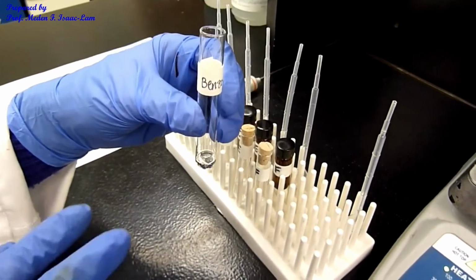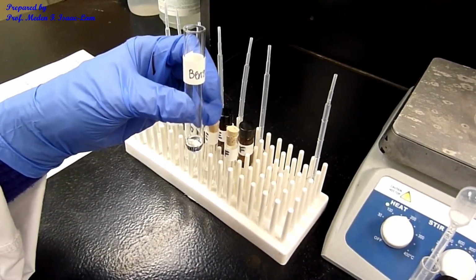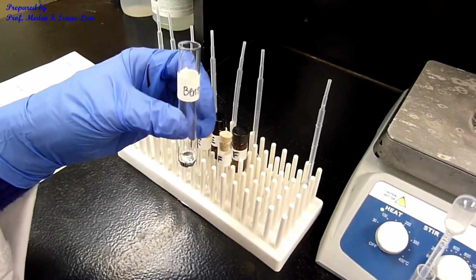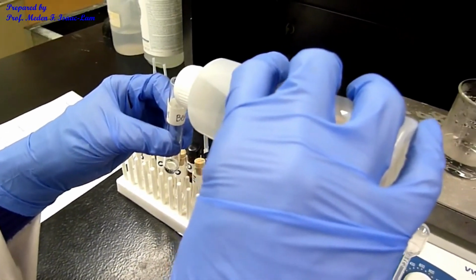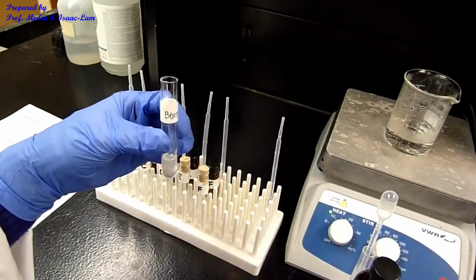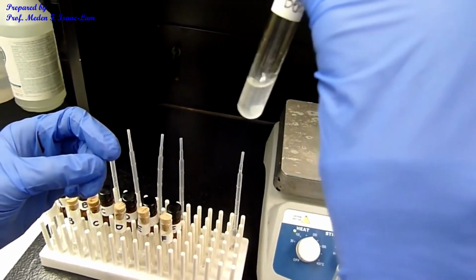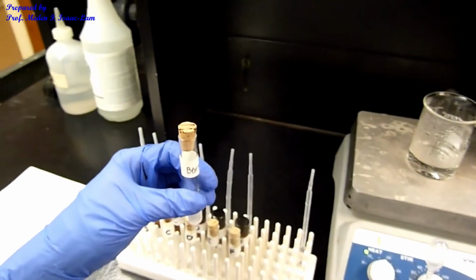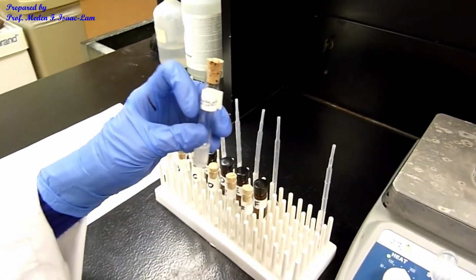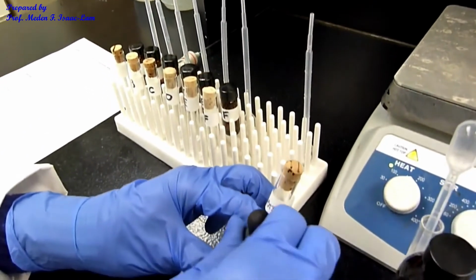So after heating it up for 5 minutes, I will now add 20 drops of 1 molar hydrochloric acid on the standard and then also on the unknown. So 20 drops of 1 molar hydrochloric acid. Okay, and then shake it. There's a little bit of cloudiness, but I think it's not too bad. So I think I'm just going to add the 10% iron(III) chloride. Okay, so I'm going to add 1 drop.